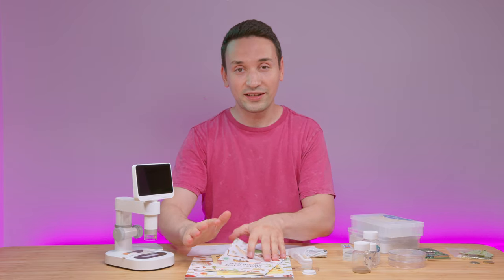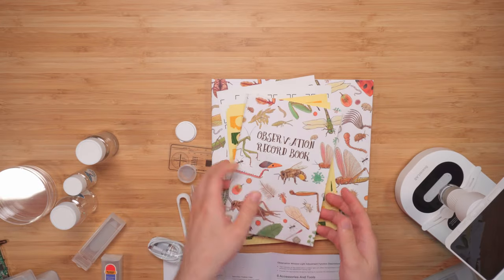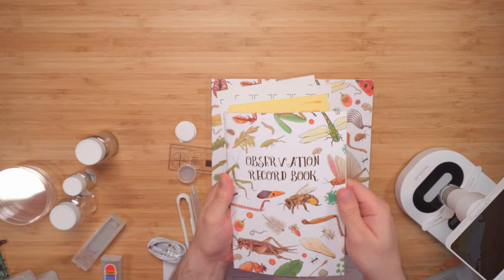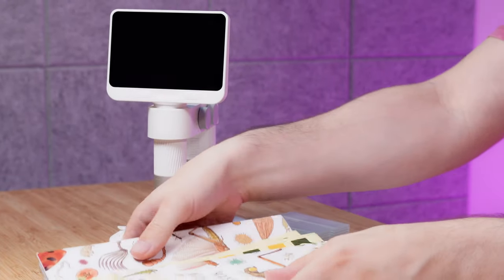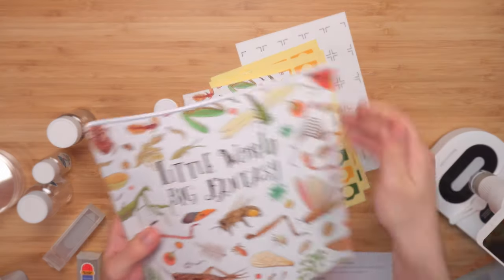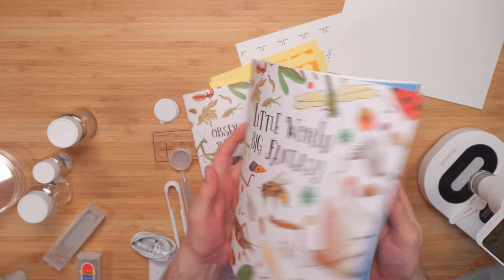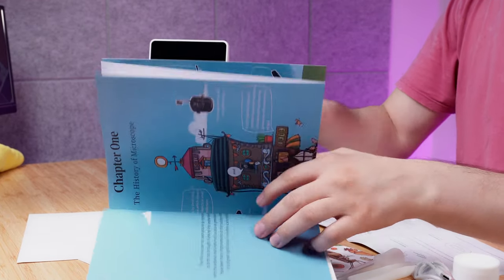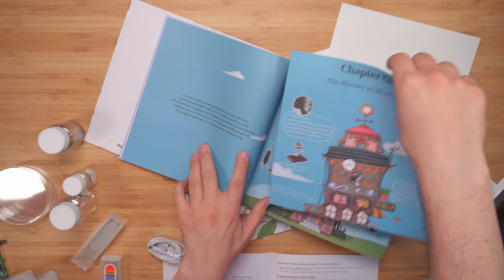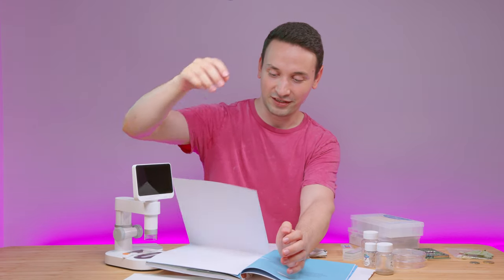One thing I was very surprised by is the quality of the included items, especially the booklets. This one is the observation record book and it looks pretty good. But the really impressive one is this book called 'The Little World, The Big Fantasy' — it's very colorful, has fold-out pages, and some great artwork.